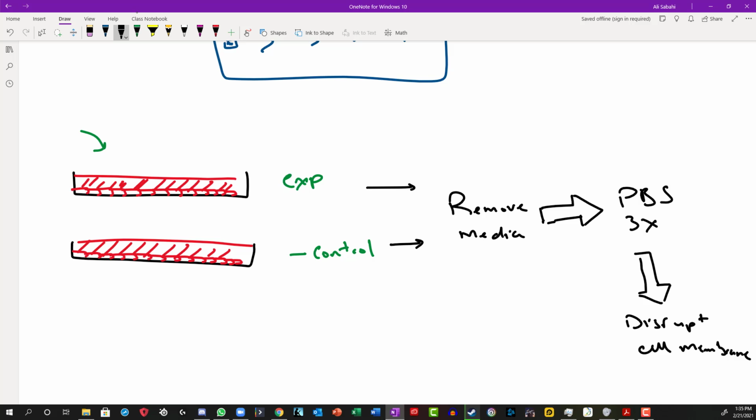So now I have all the cellular proteins. And there's a step that you can do to get rid of all the gunk, like the phospholipid bilayer and all that other stuff that you don't need because you just want the cellular protein, but that's not important. We've disrupted the cell membrane, and essentially now we have all the cellular proteins.